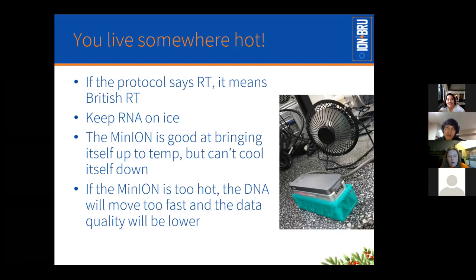One thing you might not have thought of is that the MinION does not do well in heat either. So it's very good at bringing itself up to temperature, but it cannot cool itself down. So when we were in the Philippines, we had these little mini desk fans, just USB desk fans pointed at the MinION the whole time. And this is a 3D printed stand that allows for better air circulation around the MinION.